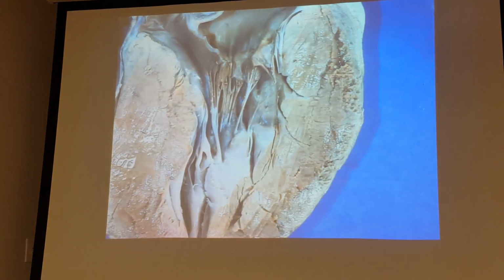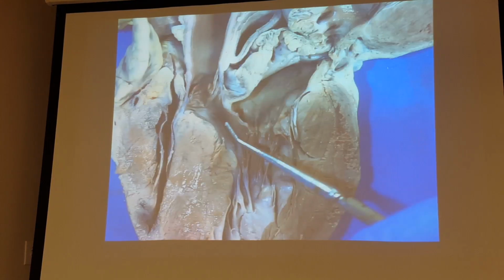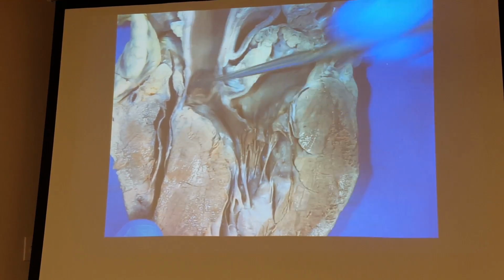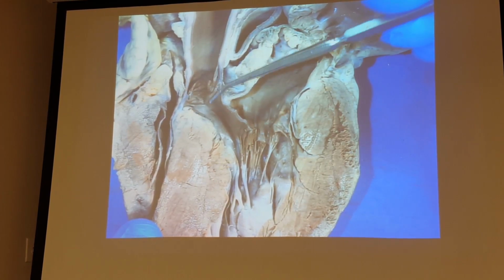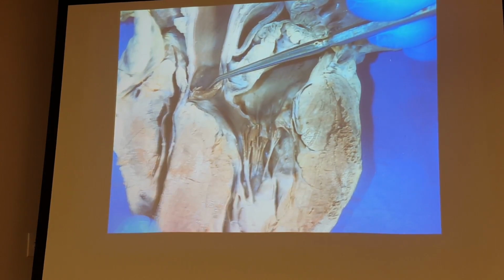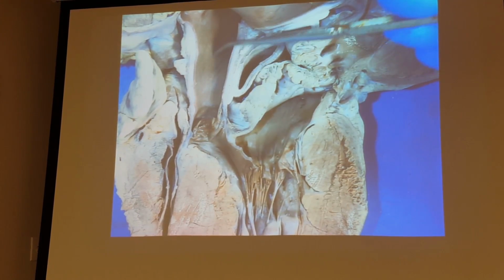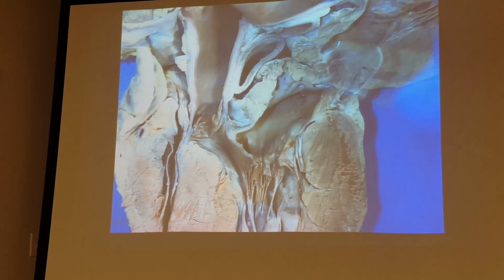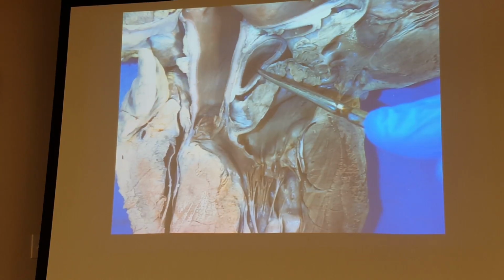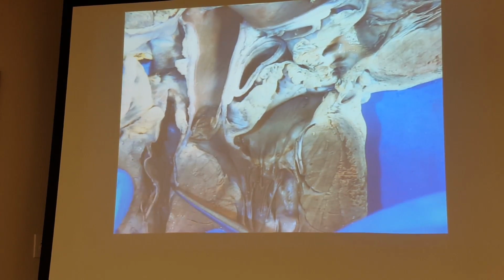Now, because this is the left ventricle, if we move a little bit superior, there are additional flaps right here. Those are the flaps of the aortic valve, and then here is the first part of the ascending aorta. Now this big hole here is the pulmonary trunk that's been cut, coming from the right ventricle over here.